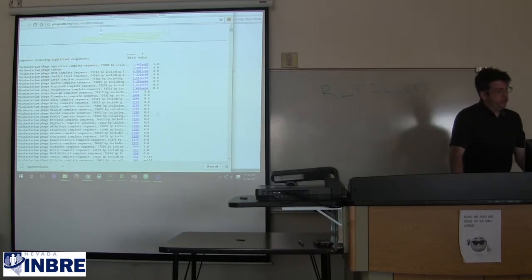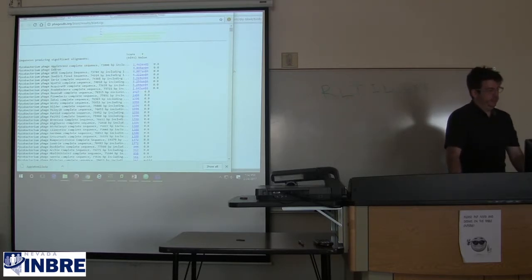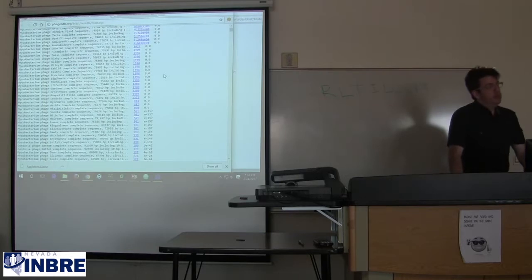A lot of these, this first page of hits, are all expectation value 0.0, which means that the way the e-value is computed, it was below 1 times 10 to the negative 179. And so those are extremely similar hits. If you had 40,000 bases matching or nearly perfectly matching, that's extremely similar, as is the case in LeBron. So that's why it's saying zeros?